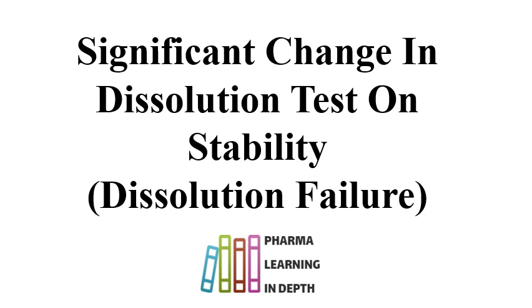Dissolution is a product performance test, and dissolution test serves as an in vitro test for providing you the information regarding the in vivo behavior of the formulation.